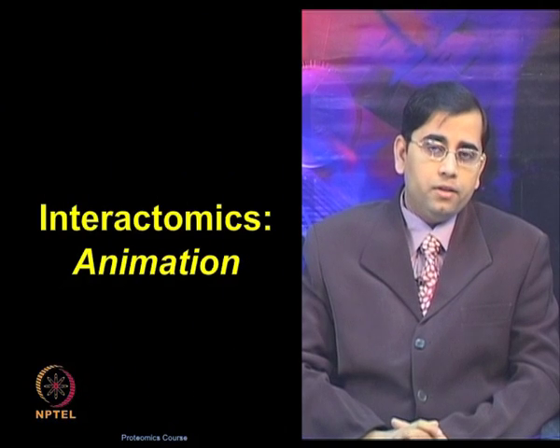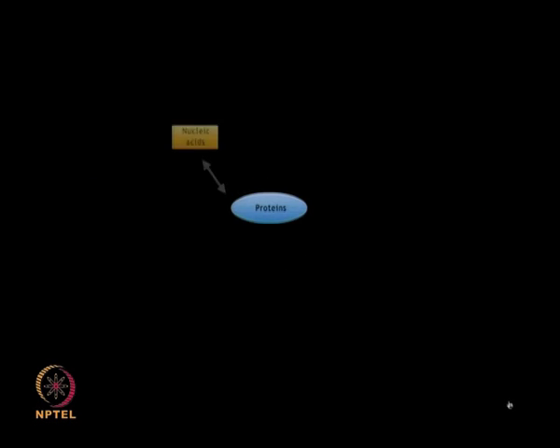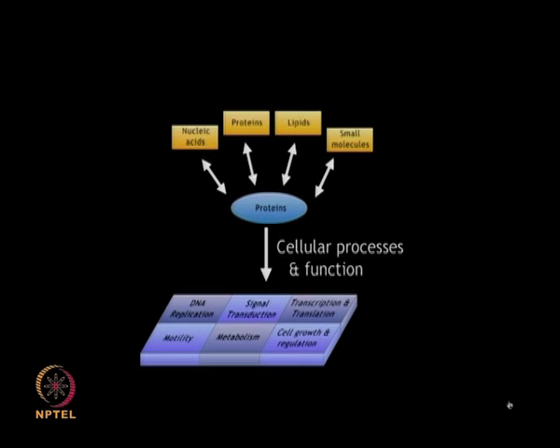So, let me describe a few concepts involved in the interactomics field by showing you this animation. So, let us discuss interactomics and its significance in this animation. Interaction studies of proteins with various biomolecules help to decipher and understand the function of various proteins in the complex network of cellular pathways.